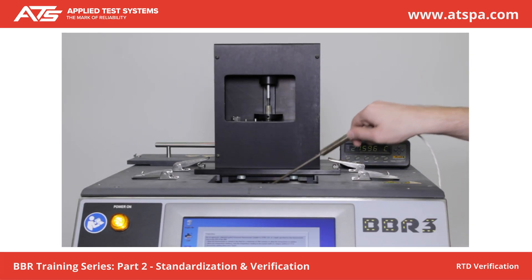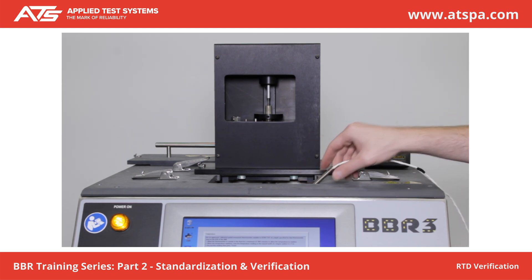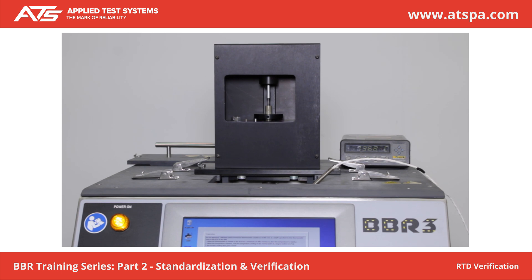Place a calibrated thermometer in the bath close to the RTD. Compare the system temperature with the calibrated thermometer. Temperature must be within plus or minus 0.1 degrees C. Mark Verification Complete if observations are satisfactory. Press Next.